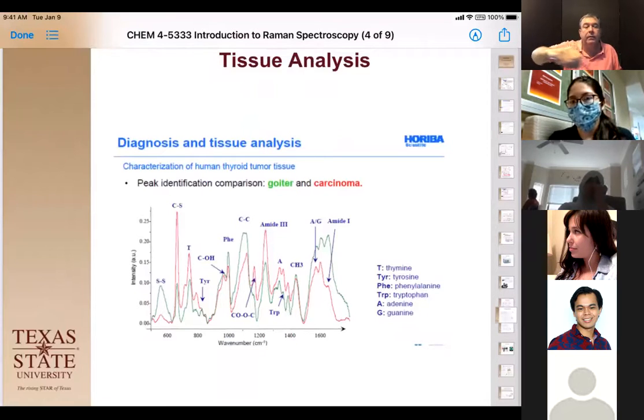And so you can go in, take a slice, take your Raman microscope, and look for these emissions from the system, and compare that to normal tissue. Well, not quantify, but you can successfully say, oh, this is definitely cancerous tissue. And if you have enough of it, you can figure out that it's located to this very small area, and so we can actually find all the margins on this cancerous area. That would be kind of cool if you were going into the biomedical field as well.